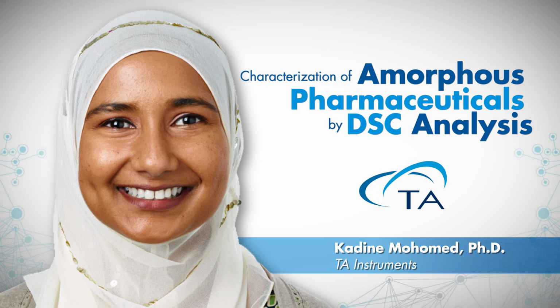It's a relationship which can be found in a lot of thermal analysis books. It's the Fox-Flory equation. So if the material is miscible, you would likely see just a single glass transition, and it falls somewhere between the Tg of component 1 and component 2.